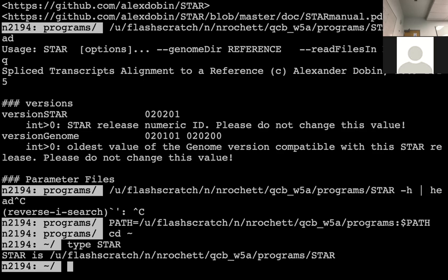No, that particular file that has trimmed in the name is already trimmed. If you want to go back to the original size, I showed the command, but I didn't give the full command.